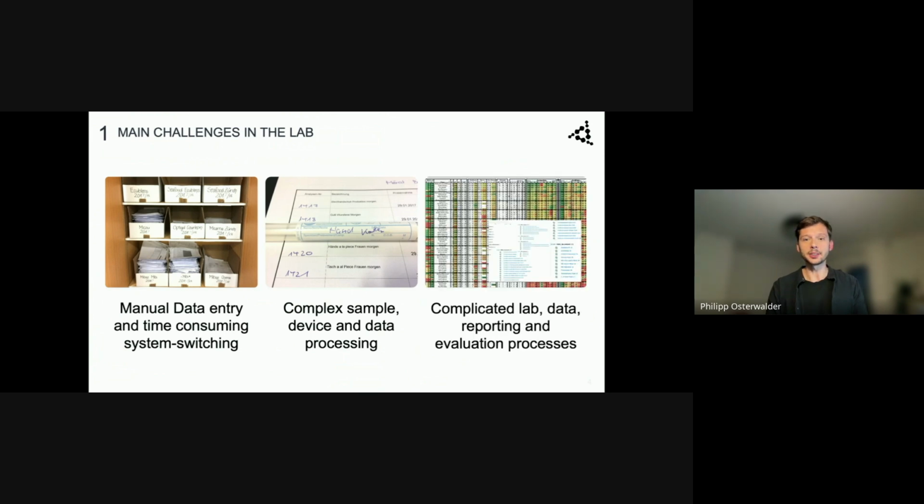And at the end we have the famous Excel spreadsheets. They are heavily used all over the world, and they are one of the biggest myths to get rid of in laboratories, because a lot of quality data in a lot of manufacturing companies is really built on data managed in spreadsheets.